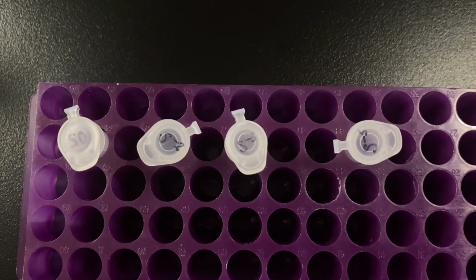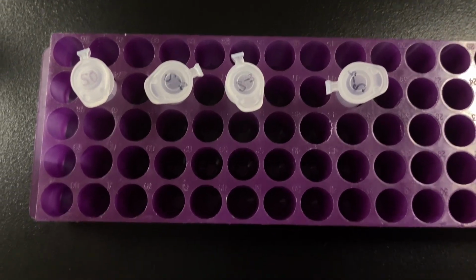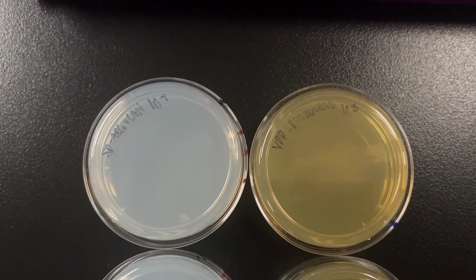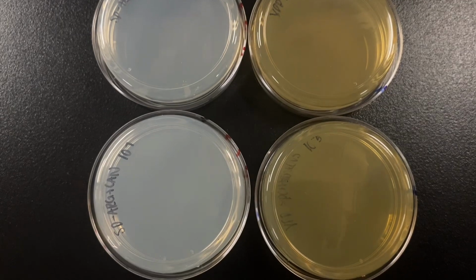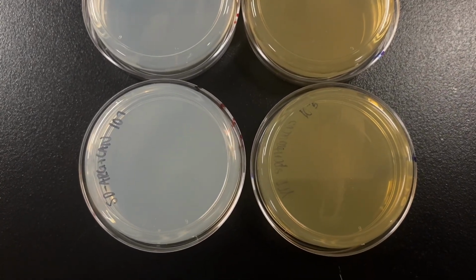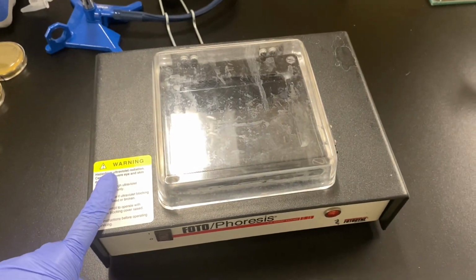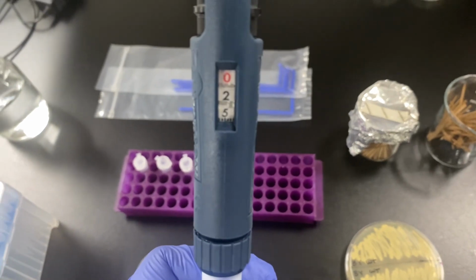First start off with labeling your Eppendorf tubes and plates to ensure that you do not confuse them with each other and are able to monitor your progress and results. To measure the mutation rate for spontaneous mutation, each partner will only require one of each of these plates. Additionally, remember that later on, you will need a transilluminator and hydrogen peroxide solution for the later portions of this lab.